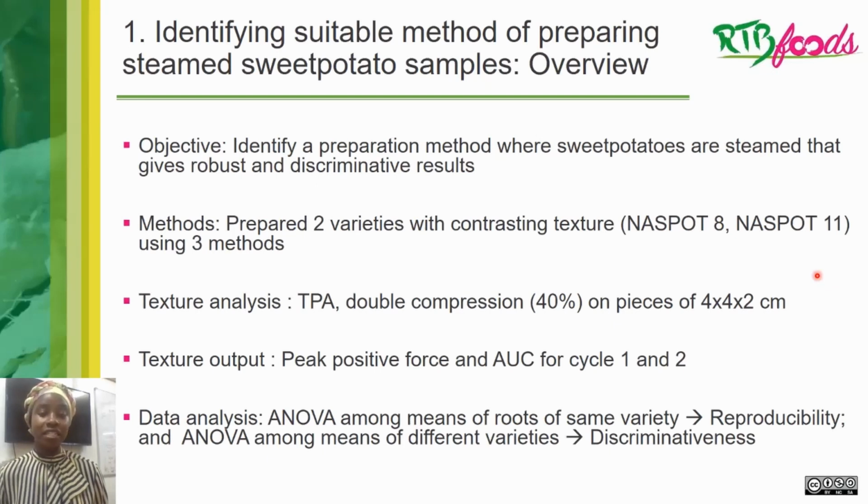For texture analysis, in all cases, we did TPA, double compression, 40% compression on pieces of this dimension. And for the texture output, we focused on parameters of peak positive force and area under the curve in both the first and second cycles.